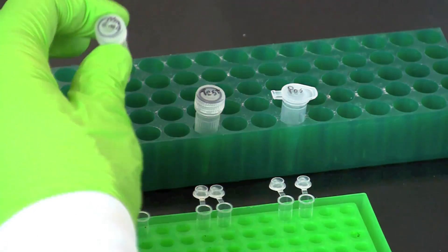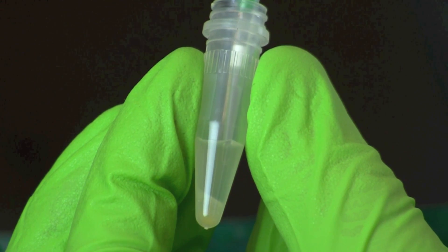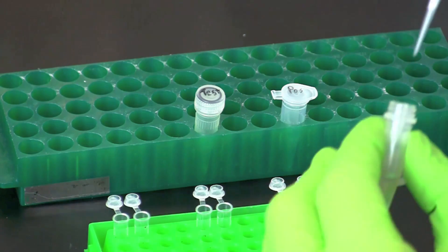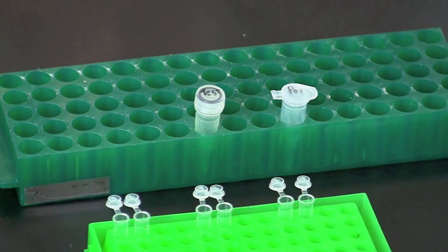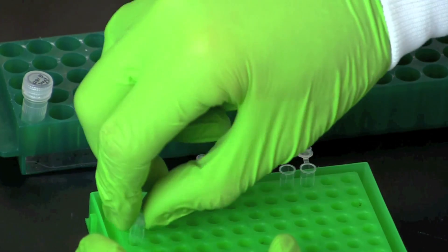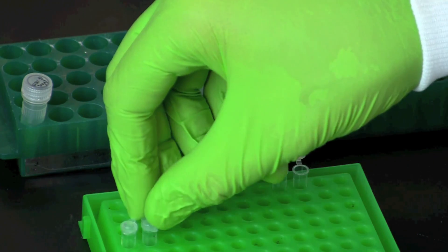Using a fresh tip each time, pipette 20 microliters of the indicated template DNA to each PCR tube. Make certain when obtaining your DNA sample that you are drawing from the upper supernatant and not from the pellet of InstaGene matrix at the bottom of each tube. The InstaGene matrix will inhibit the PCR reaction. After pipetting the DNA into each set of tubes, close the caps to prevent contamination. Repeat this process with the other DNA samples.